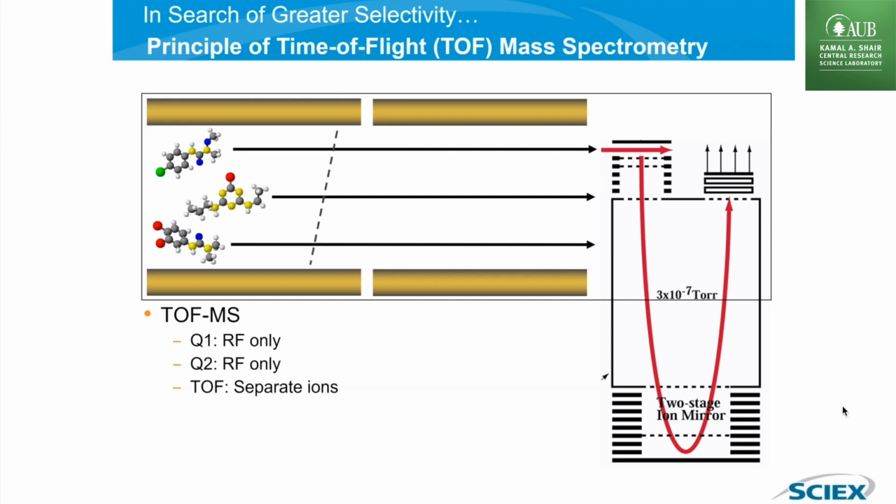All right, sorry. So this is also referred to as full scan. We are not focusing the instrument on any particular ion. We are doing full scan of the whole mass range. Whatever's present, we're going to see it. We're not tuning the instrument for one particular compound or one particular mass. We're seeing everything in that mass range.